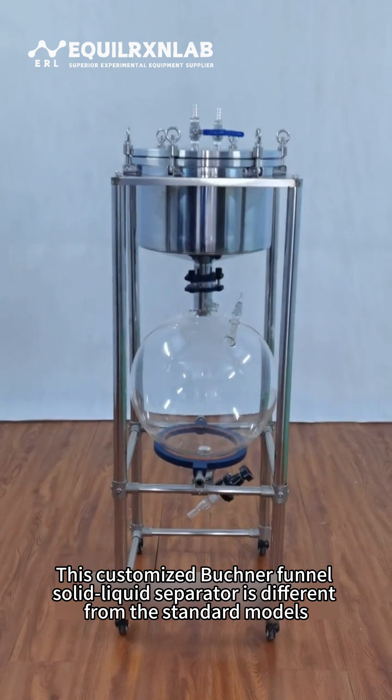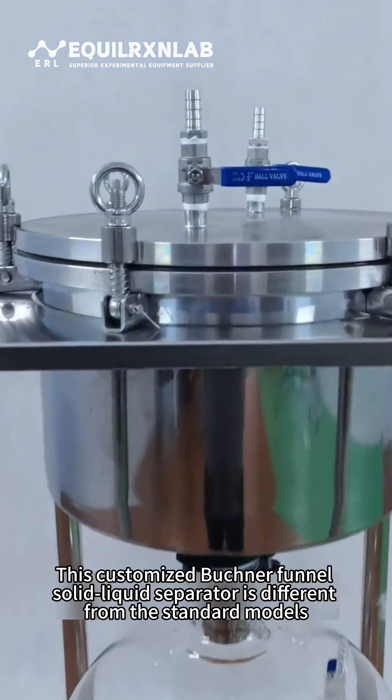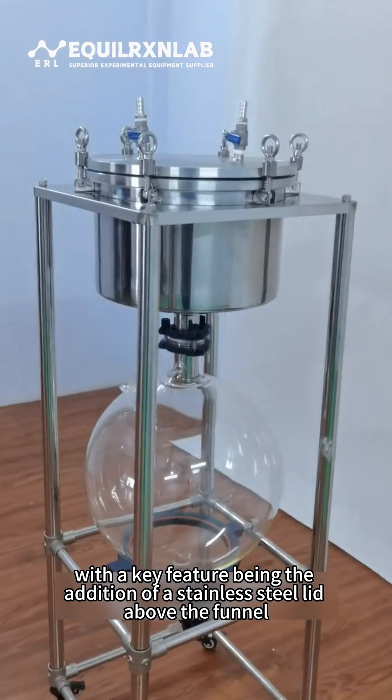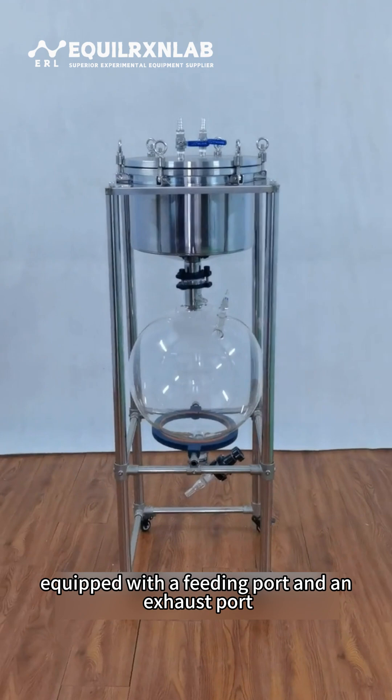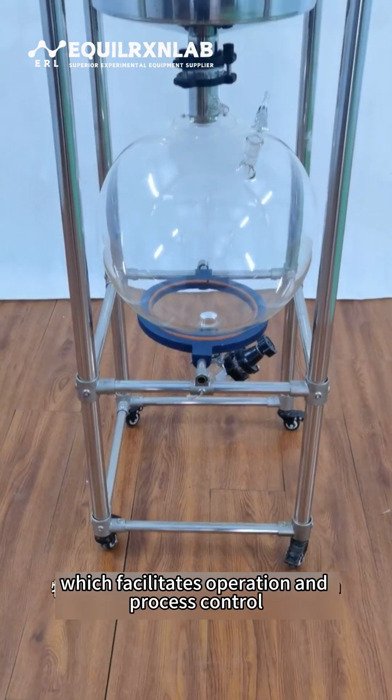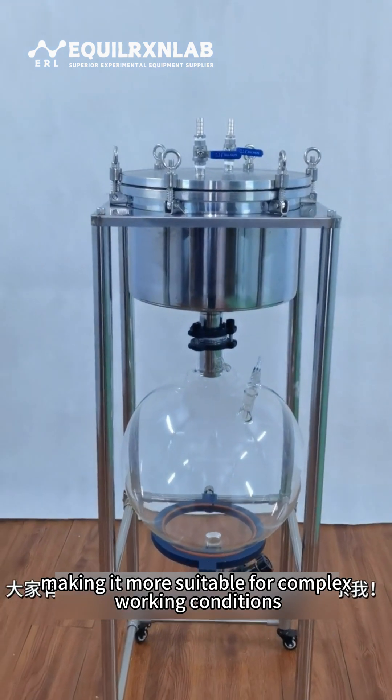This customized Buchner Funnel Solid-Liquid Separator is different from standard models, with a key feature being the addition of a stainless steel lid above the funnel, equipped with a feeding port and an exhaust port, which facilitates operation and process control, making it more suitable for complex working conditions.